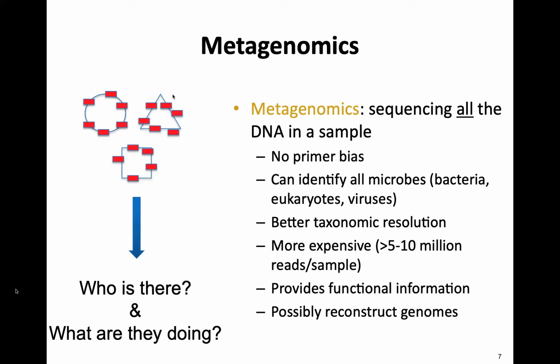One thing we've been barking up the tree about lately is that people have done human genome sequencing or human genotyping, and they've tossed any reads that didn't map to the human genome. But in theory, if there's microbes there, they would have microbial reads that they just filtered out. And so we're starting to get a couple of projects going at that angle.